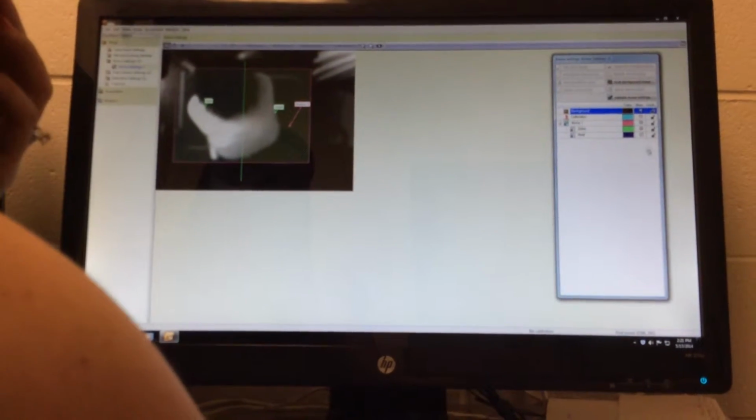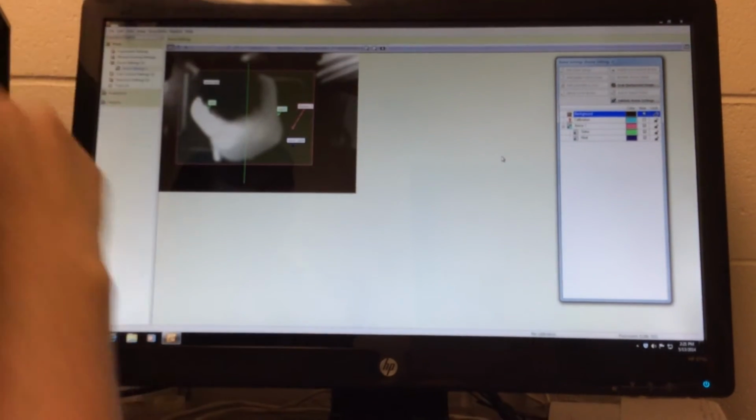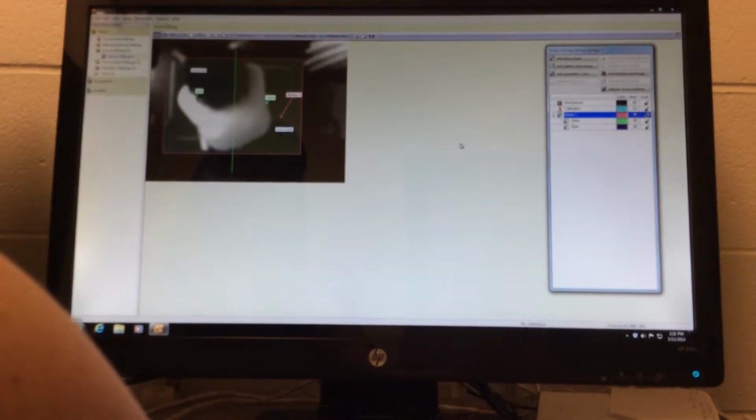Okay. Let me see them all. So you can add multiple zone groups. That's okay.